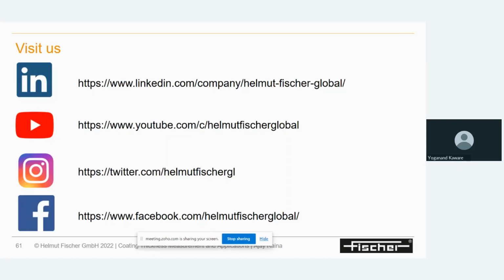Ajay sir, I think the question is how to place solution. It means if they want to do solution bath analysis, then how can they check the solution, the bath? So I think it is like to place solution, basically for the bath solution only. Is there any SOP to place the bath solution inside our machine?